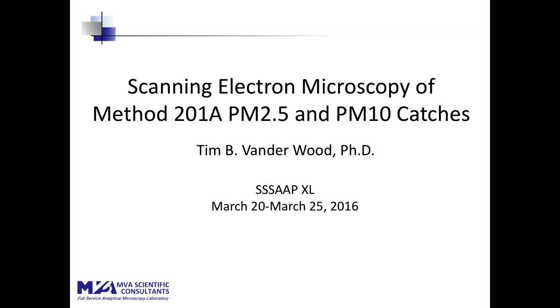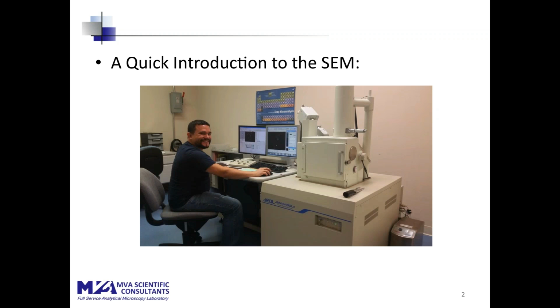I'll begin by introducing you to the microscope that we use to do this kind of work. We use a scanning electron microscope, and here's a picture of one with the operator. It's a relatively large piece of equipment, although smaller types do occur now. You must be careful a little bit in the type of instrument that you bring to this analysis, because it has to have a significant resolving power, certainly enough to see down to about 0.1 micron particles and individually resolve them.